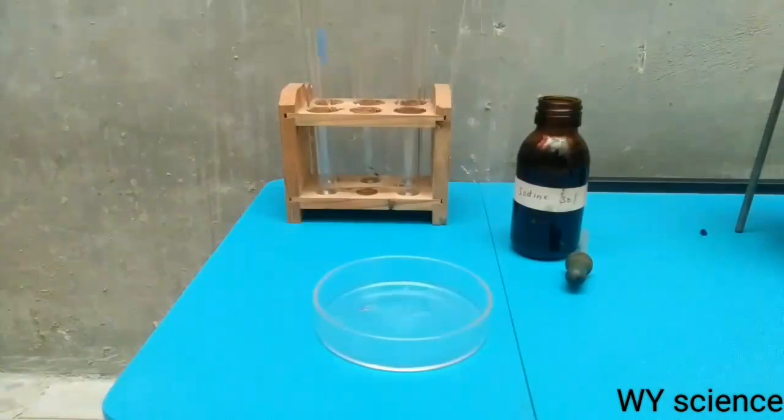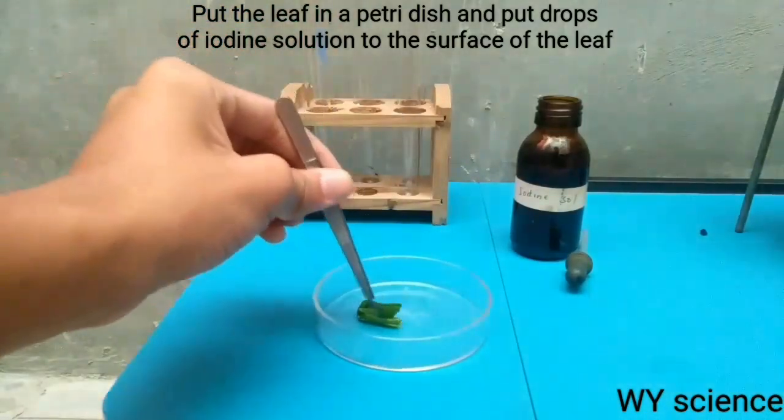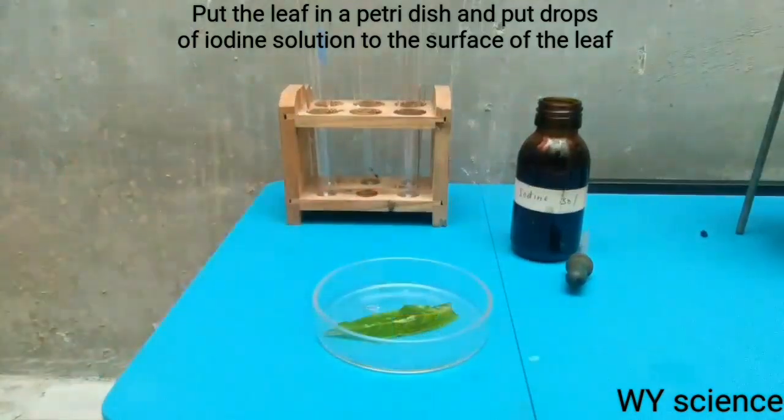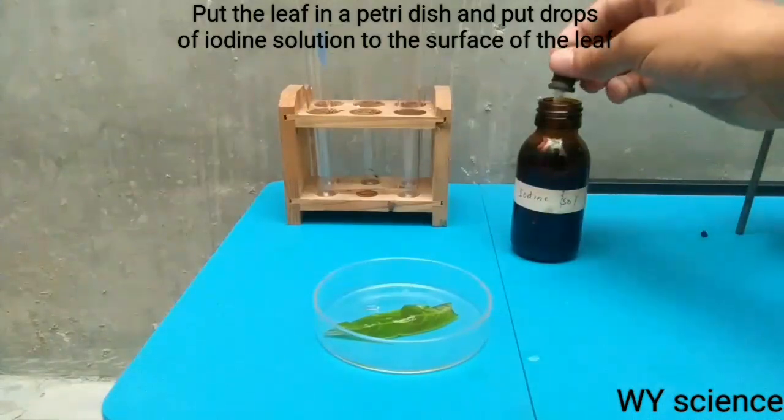After a few minutes, we can take the leaves from the test tube and put them in our petri dish. Now let us put iodine onto the leaf and see what will happen.